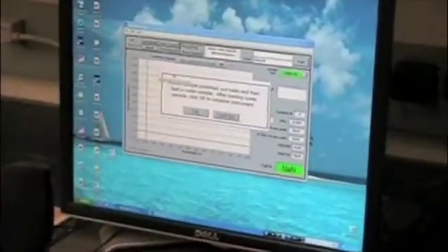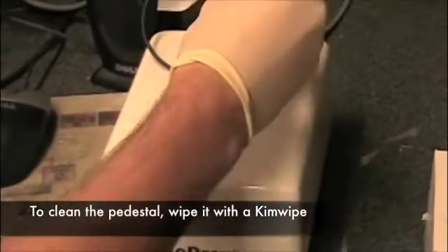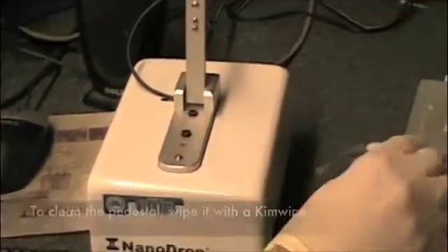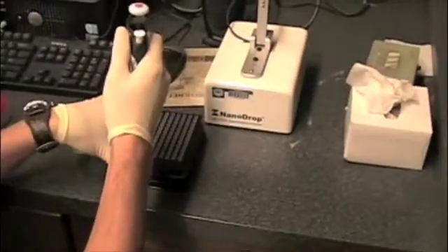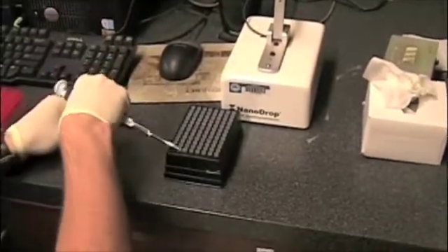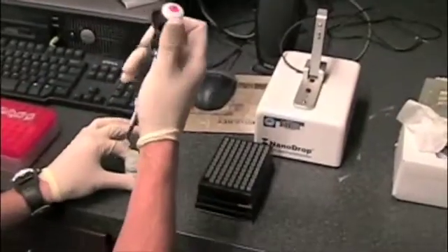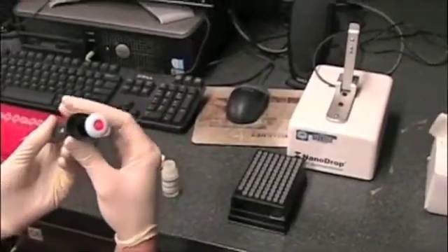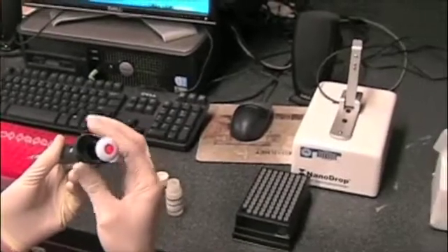We need to add a blank to standardize the Nanodrop. We lift up the little arm, wipe off the tip, just so we know that no one else's sample was left on there inadvertently. With a tip on there, the volume you're putting on is 1.5 microliters — you actually get fewer bubbles and it's a little easier to place on the little spot.